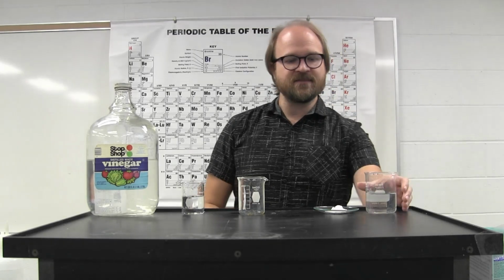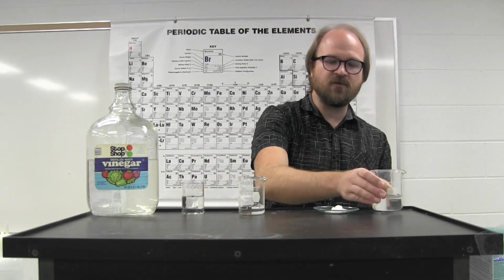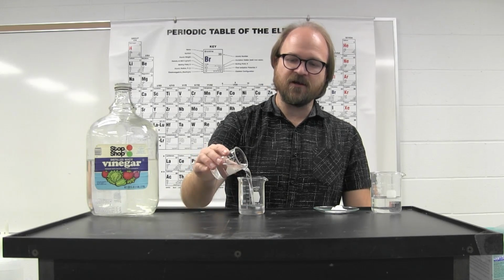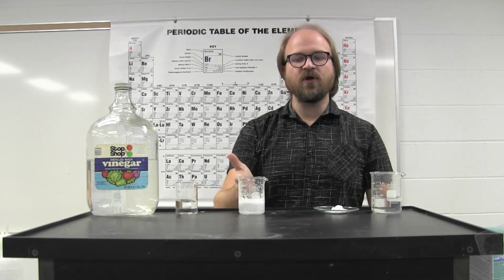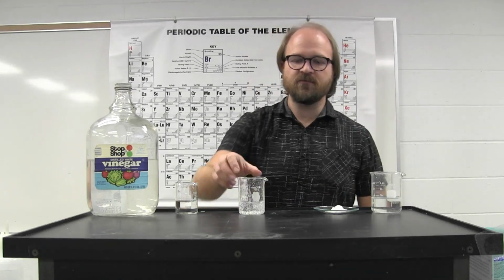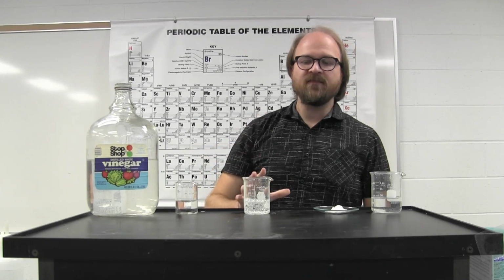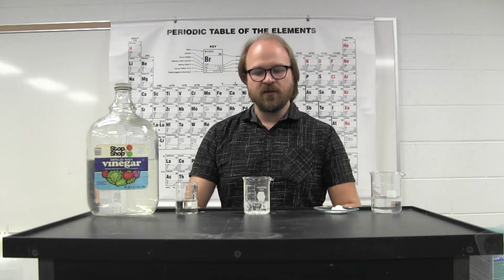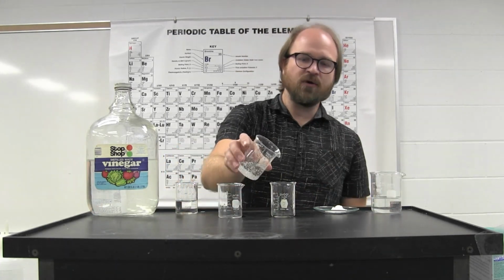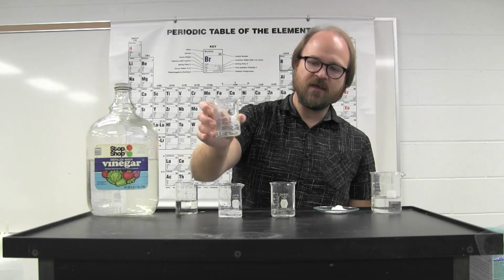And when you take these together, you're going to be mixing some baking soda solution and some vinegar, and that will cause the reaction. And you've seen this reaction before. It's the reaction of baking soda and vinegar. When the reaction is complete, you're going to be taking 2 smaller containers and pouring some of that reaction mixture into each of them.